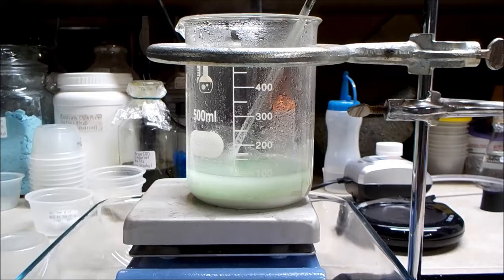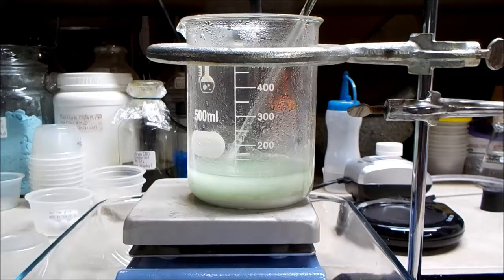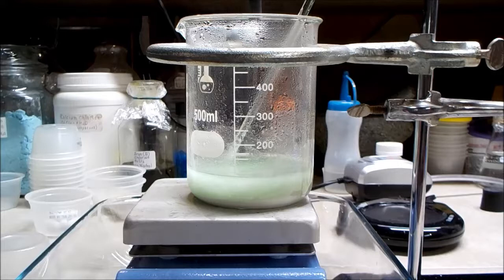Okay, what you just saw was what we call bumping, and that's when salt settles on the bottom, you get a superheated layer of liquid, then it suddenly boils and creates this effect. It's not really desirable at all, and as you can see, I've put an additional ring around here to keep the beaker from actually bouncing off of the hot plate.